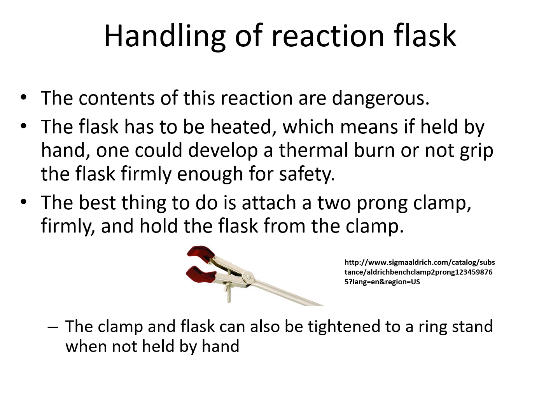Instead, you can use tongs. It's like a scissor kind of instrument we use in the lab to hold flasks. But a better way, not only to transfer the glassware, but also to keep it tightly seated in the heating source, you can use the clamp that you're seeing in the slide, and you can then attach the clamp to an iron stand.